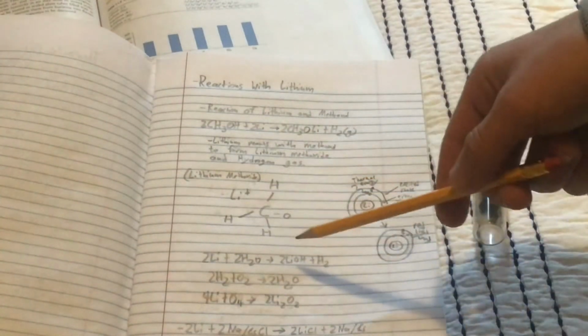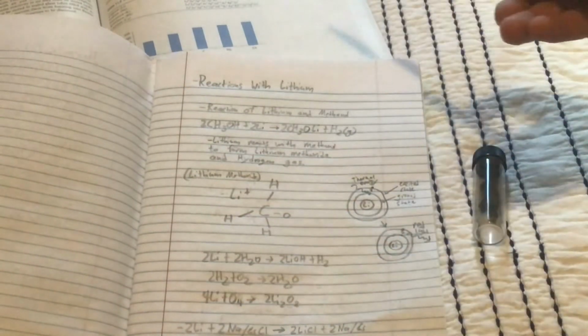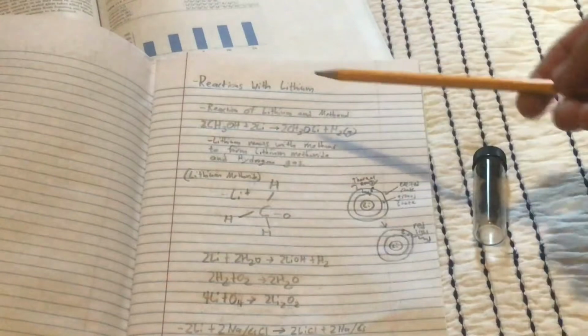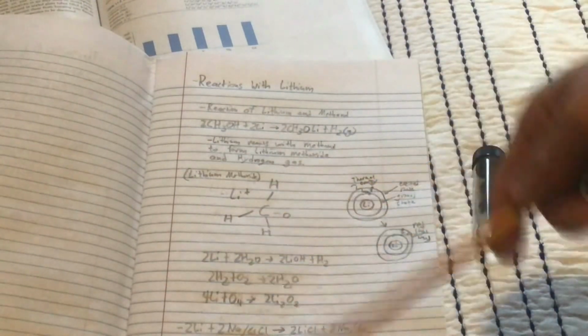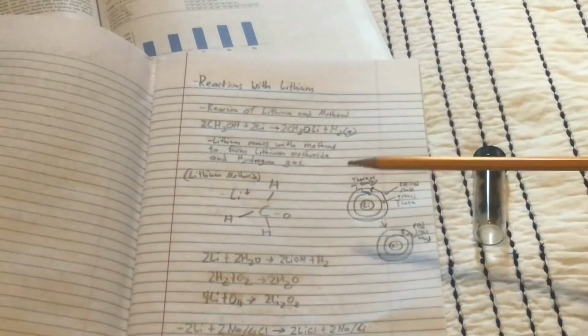And something else I've noticed is that when lithium burns, it produces almost all the colors of the electromagnetic spectrum, from white to green to blue to purple, red, orange, yellow. I don't really have any explanation for this. It's probably because it's pretty unstable, so it rapidly switches energy levels. But anyways, you have to see this for yourself.